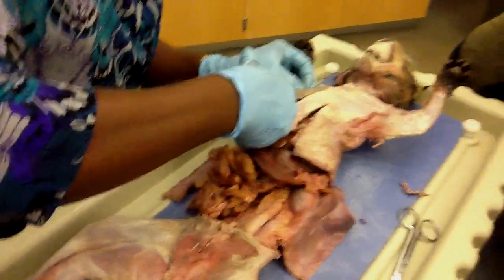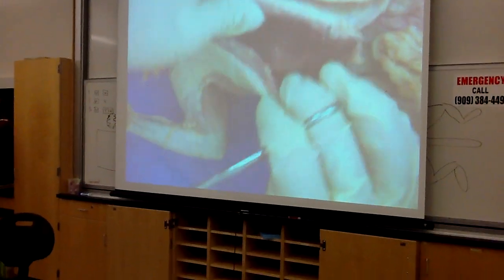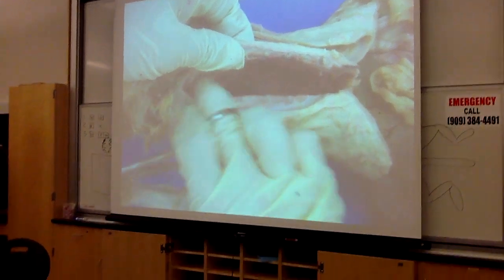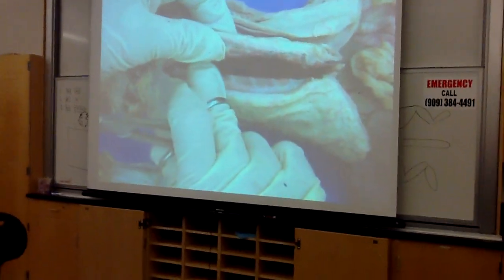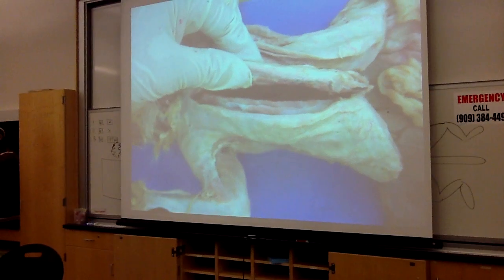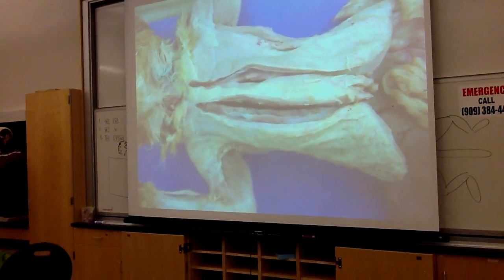Everybody just stop for a second. Let me show you. There's just 2 more cuts, and then we can clean up our tools and put them away. But what I'm going to do now is I'm going to kind of look in here. I'm going to pull up on the sternum, and some of it may be torn, but you're likely to see some transparent membrane under here. Again, these are those membranes that we find wherever we have moving organs. Every time you breathe, your lungs slip and slide here, and there's some membrane here running down the middle so that the lungs don't rub against each other.